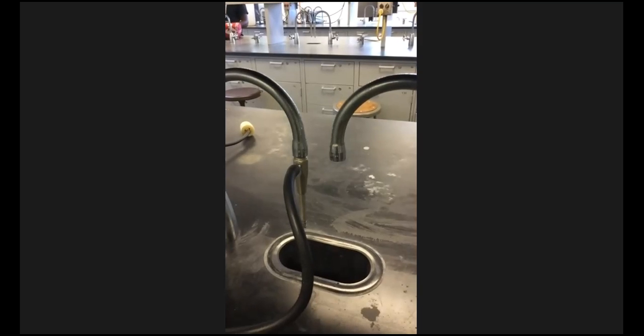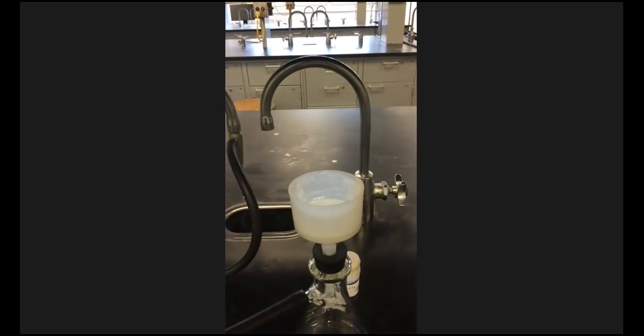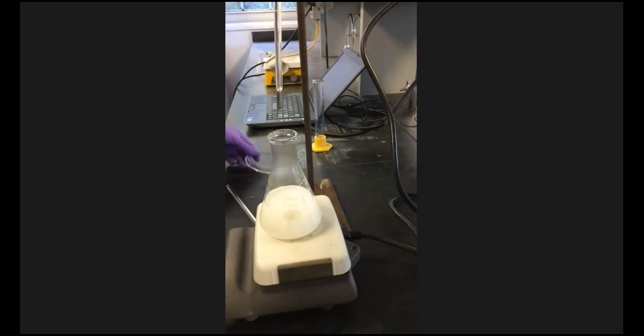All right, so once this is heated for the proper amount of time, we're gonna filter it. Then when we filter it, we're gonna take the filtrate, the liquid layer, and we're gonna test it to figure out which one is the limiting reagent. All right, so how much time we got left heating wise? 7 minutes. All right, let me check this temperature again.